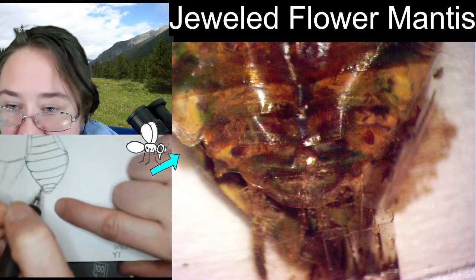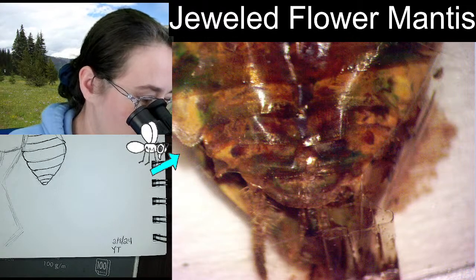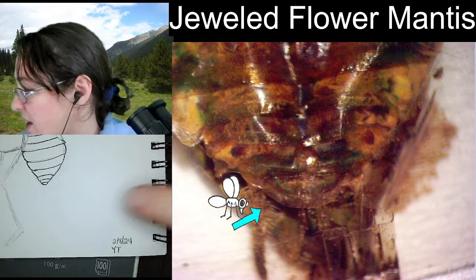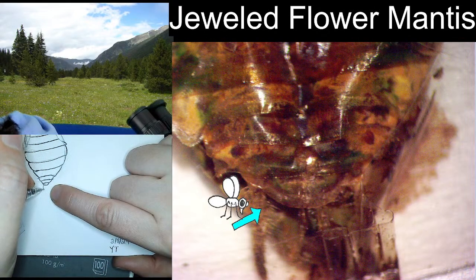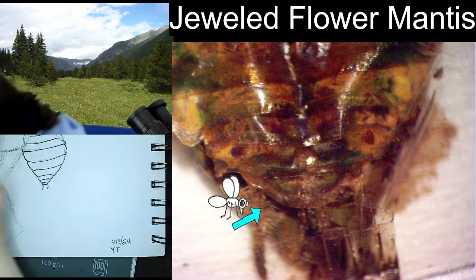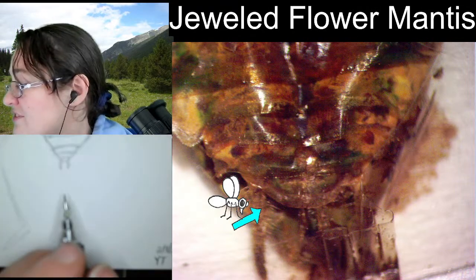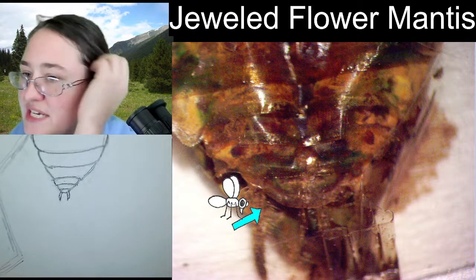Love it. All right, so way down here at the very end of our abdomen, we do get to cerci. Now, that is this little finger-like appendage right here. It's connected to the final abdominal segment, so if you come right about here, the last segment gets 1 little finger-like appendage, 2 little finger-like appendages. All right, those are the little cerci, spelled C-E-R-C-I. Or individually, it is a cercus, spelled C-E-R-C-U-S.